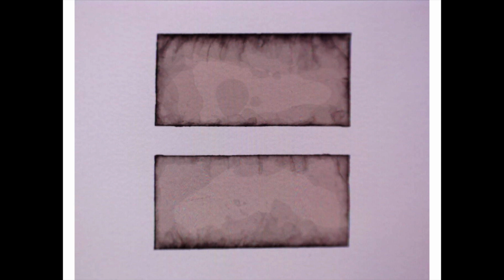As these muscovite plates are lying on that cleavage surface, that lets us know that we're looking onto the plane of the A and B crystallographic axes. However, we don't know exactly where in this plane those A and B crystallographic axes lie. We're going to also have to bring in some information from optical mineralogy in order to place those axes appropriately.